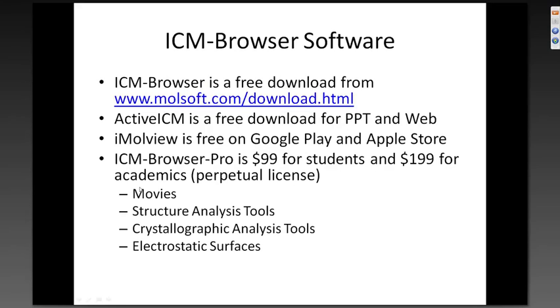And there's only one thing I'm going to show today that's in ICM Browser Pro, which actually has a license fee, but it's a perpetual license. It never expires, and that's the movies. This software does have other tools, such as structure analysis tools and crystallographic analysis and electrostatic surfaces.